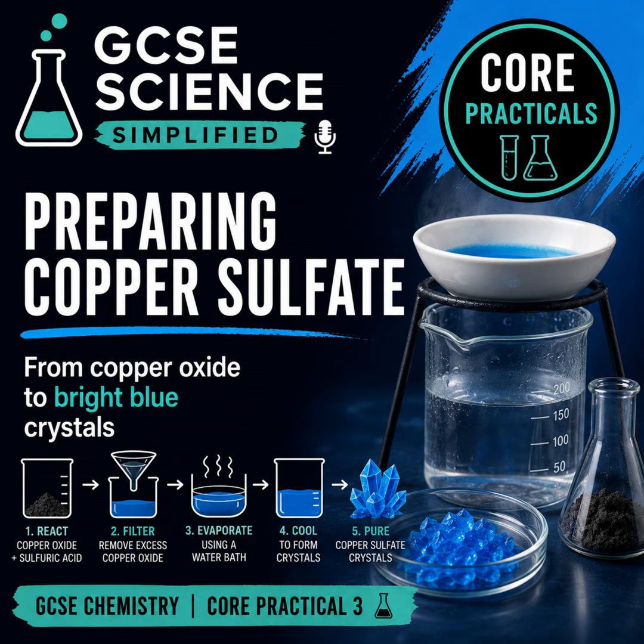Let's wrap this up. Metal oxides act as bases, and bases react with acids to neutralise, making a salt and water. We've got excess reactants to make sure that no acid remains in our solution, and we filter that out to get rid of it. Then we need to make sure we have gentle evaporation so that we get good big crystals. But we're not just making crystals. We're controlling a process to produce a pure salt. And we're proving it as we go.